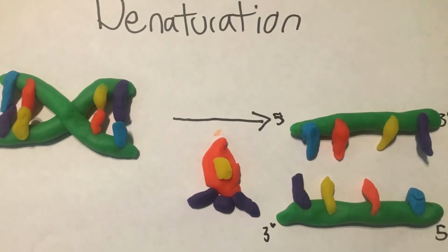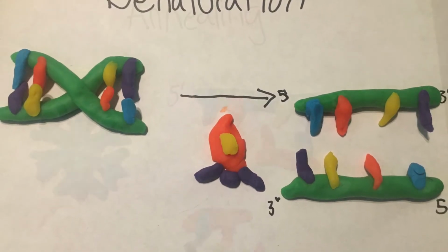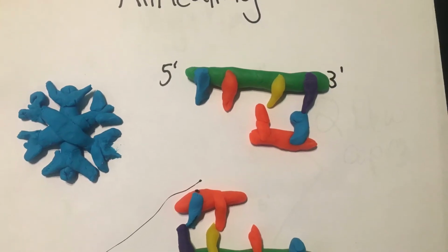PCR involves a repeat procedure of 3 steps in a thermal cycle: denaturation, annealing, and elongation. Denaturation involves the separation of the DNA strand. The DNA sample is heated to separate it, which gives a single strand template for the next step, annealing. In annealing, the reaction is cooled so the DNA primers can attach to the opposite ends of the strands.